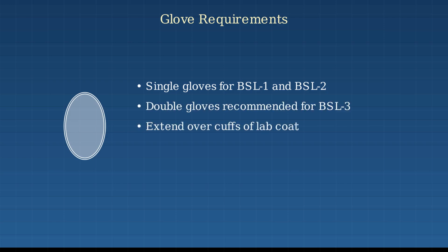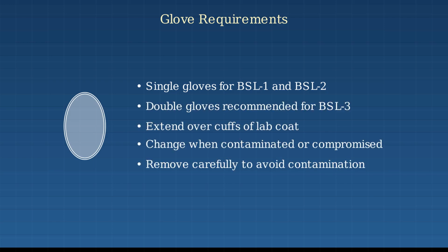For biosafety level 1 and 2 work, single gloves are typically sufficient. For BSL-3 activities, double gloving is recommended. Gloves should extend over the cuffs of your lab coat to prevent skin exposure. Change gloves whenever they become contaminated or compromised, and remove them carefully to avoid spreading contamination.